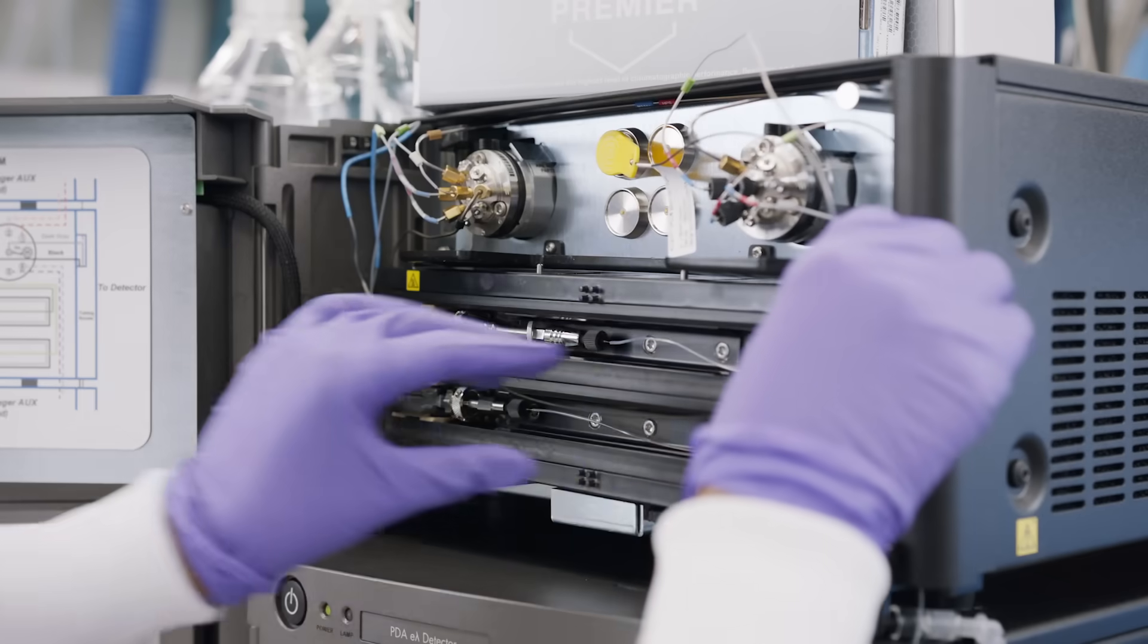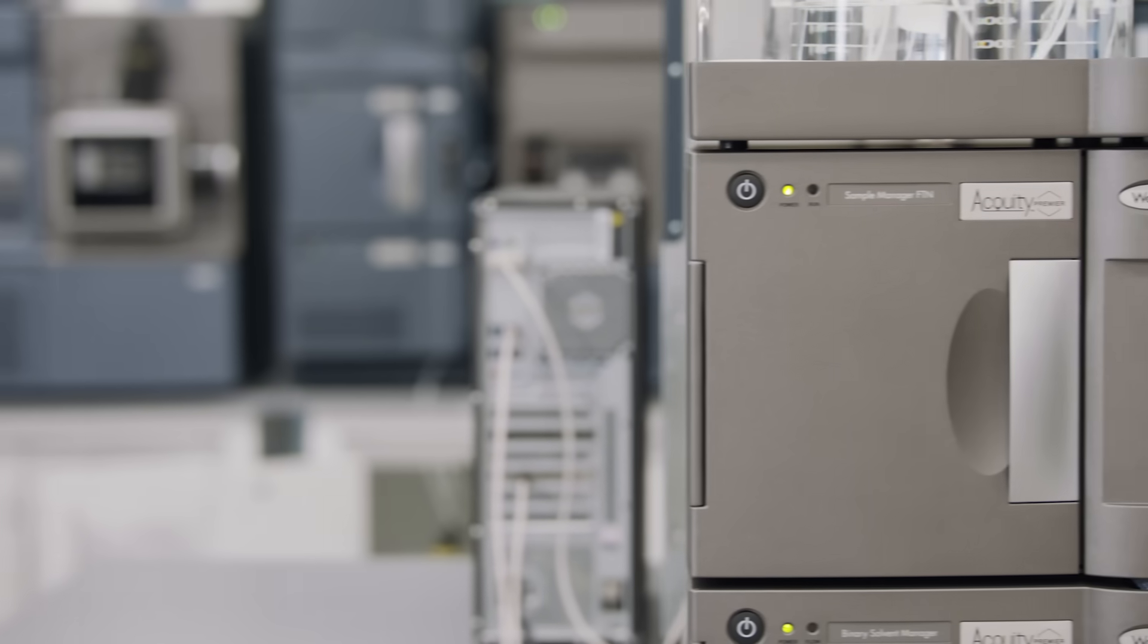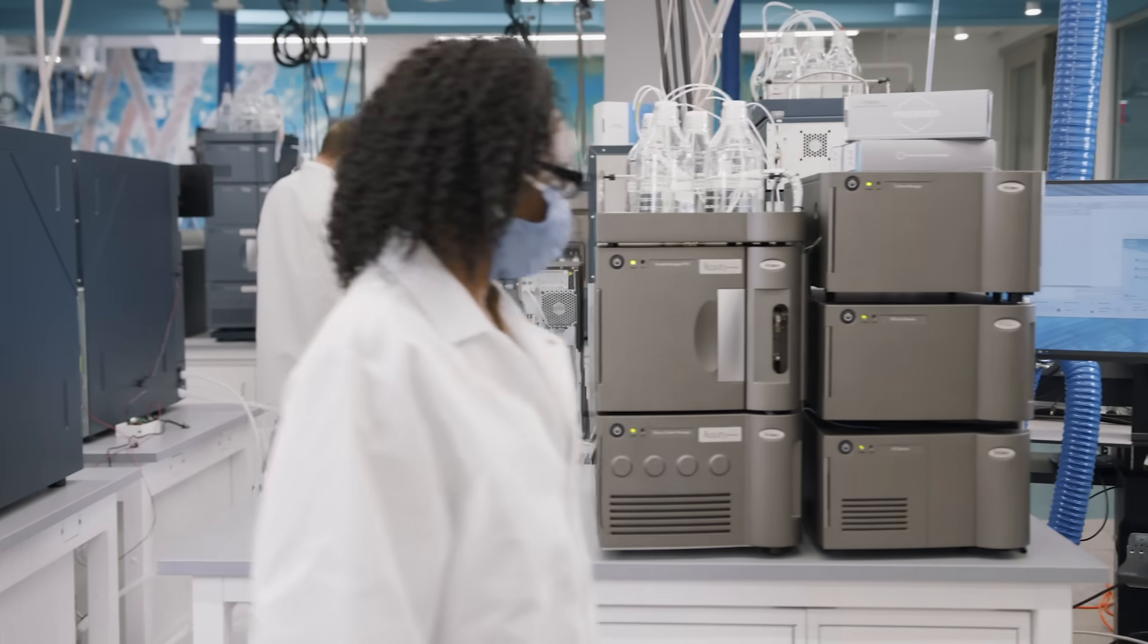The improved sensitivity, reproducibility, and simplicity of the Premier system will give you the data confidence you need to stand behind your decisions.